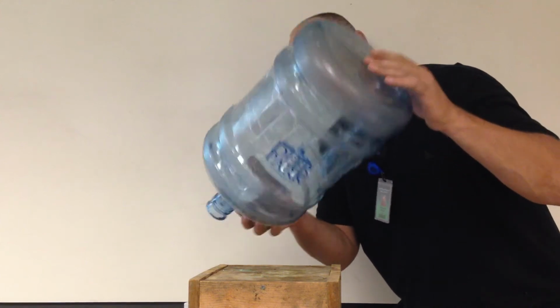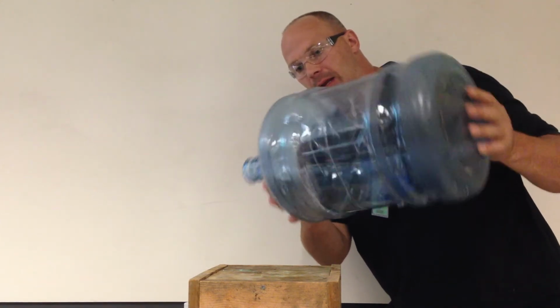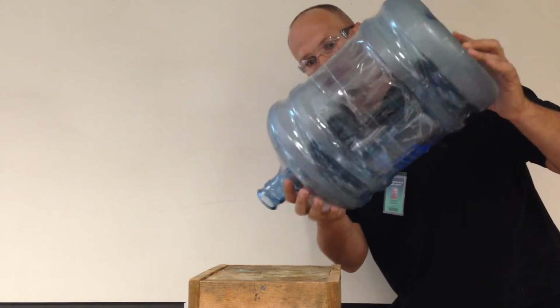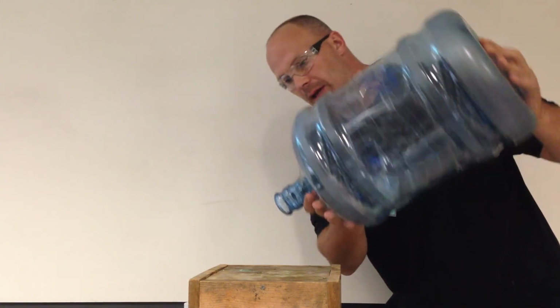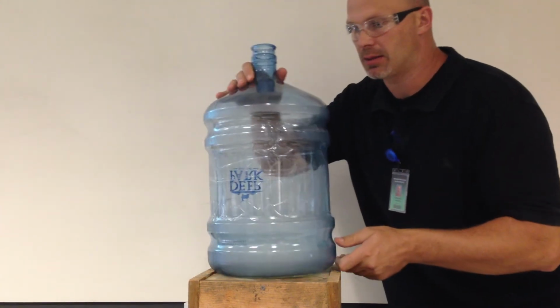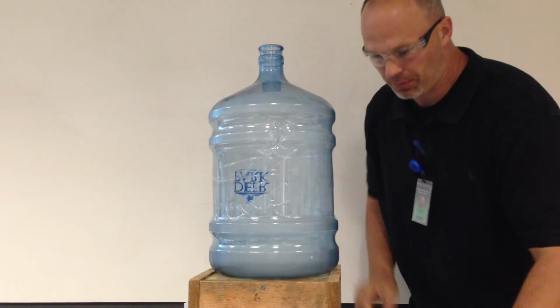And if you can see, all the alcohol that I've added is now a vapor. Okay, I've increased the surface area. As you can see, I shouldn't have much emptying out. More is not better in this case. So I've got alcohol vapor in here.